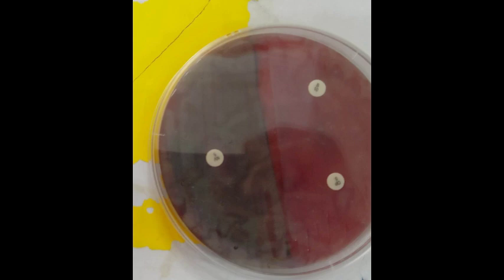On the other hand, it was noted that there was no inhibition of growth for bacitracin and optochin. Therefore, we can eliminate the possibility that this Streptococcus species is Streptococcus pneumoniae or Streptococcus pyogenes.